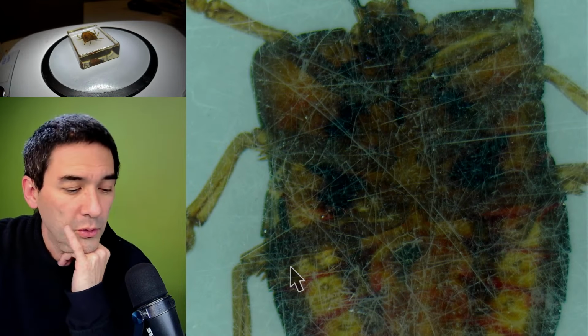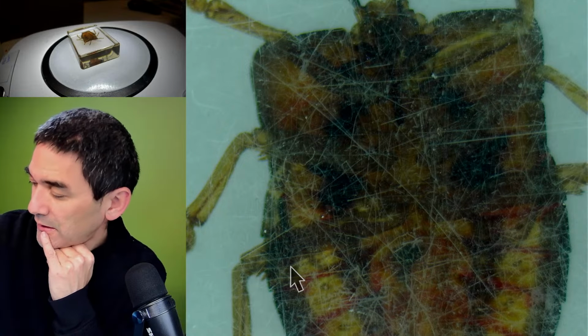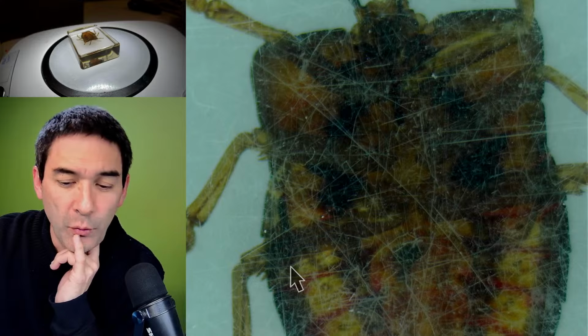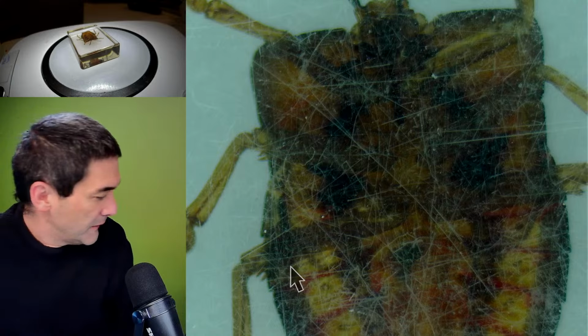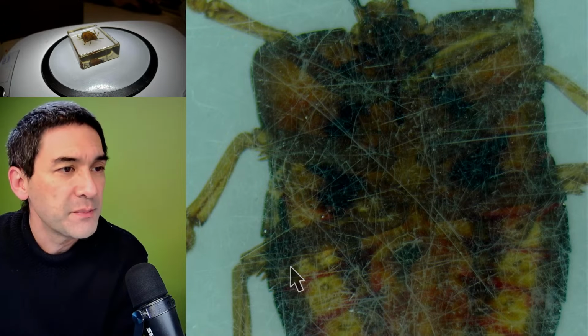Or another thing, and I don't know if this is actually a possibility, maybe it's possible to remove those scratches by adding a little bit of oil. No, I don't have oil with me right now, but I do have a little bit of glycerin over here. Look, I'm just going to show you. That's a little experiment now, okay?